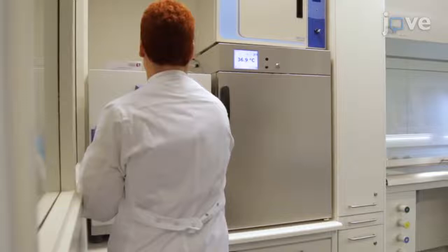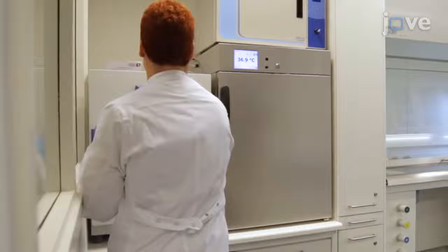Grow S. mutans and C. albicans on blood agar plates at 37 degrees Celsius under aerobic conditions. Then transfer single colonies of each organism to test tubes filled with 5 mL of brain-heart infusion and grow them for an additional 18 hours.